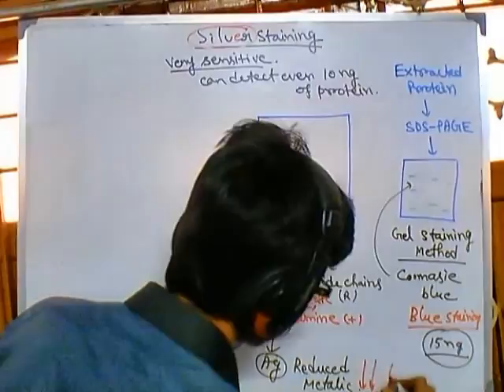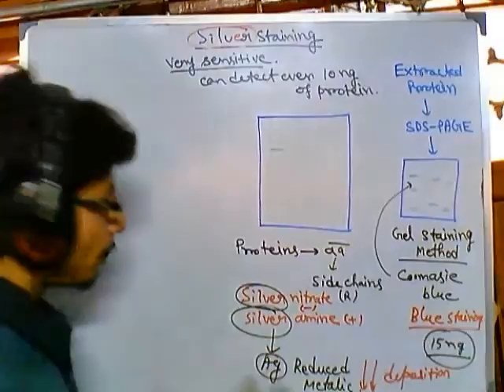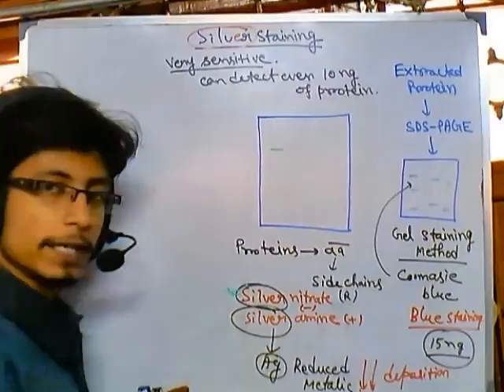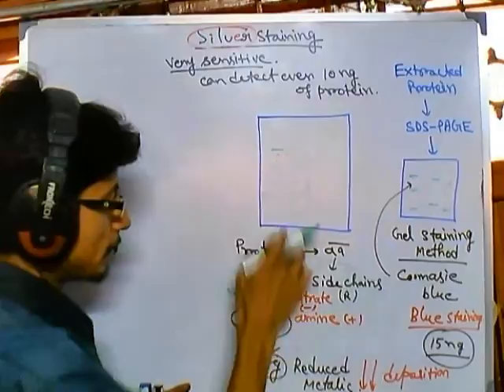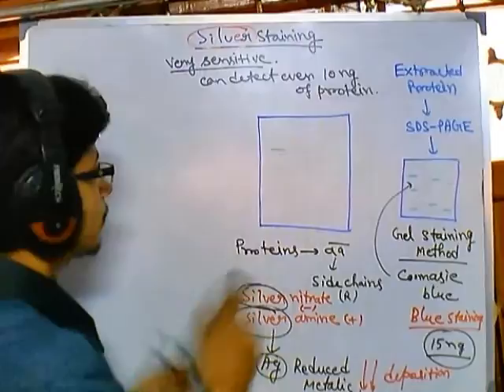Suppose here is the part where the protein is present. Due to the addition of the stain, let's say silver nitrate, the silver nitrate reacts with the side chains of the protein present here, and due to this interaction, silver nitrate is reduced, and the reduced silver is deposited as metallic free silver onto this region. As a result of deposition, we can visualize it.